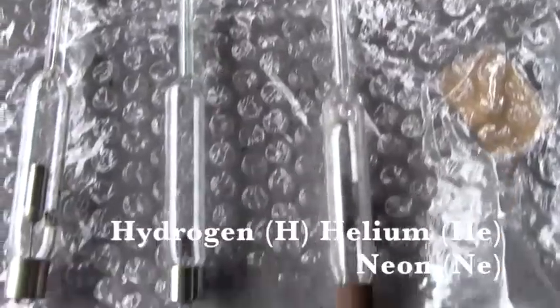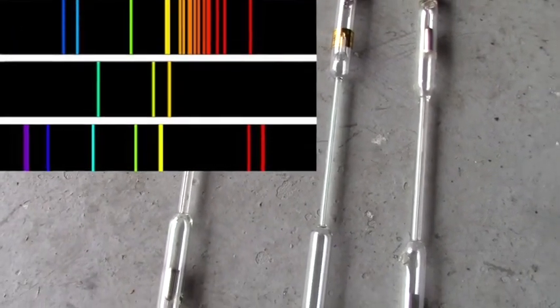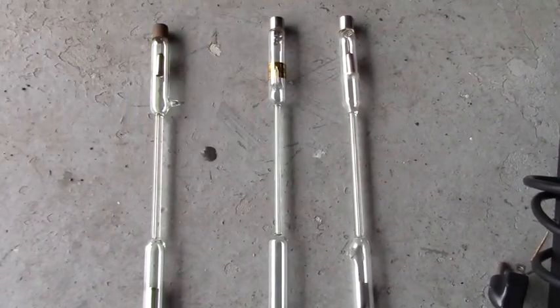This one's neon. Right now you can't tell because they're not on — they all look clear. The great thing about these is that they're long and thin, so you get nice bands in thin lines. When the light comes through in these thin lines, you can see what the emission spectrum is clearly as it matches up with lines in a wavelength chart or spectrum of wavelengths with color. To do this you'll need a diffraction grating, very easy to find at any science supply store.